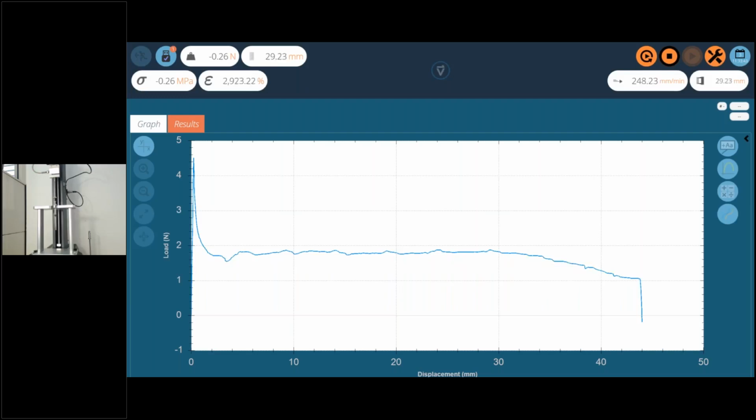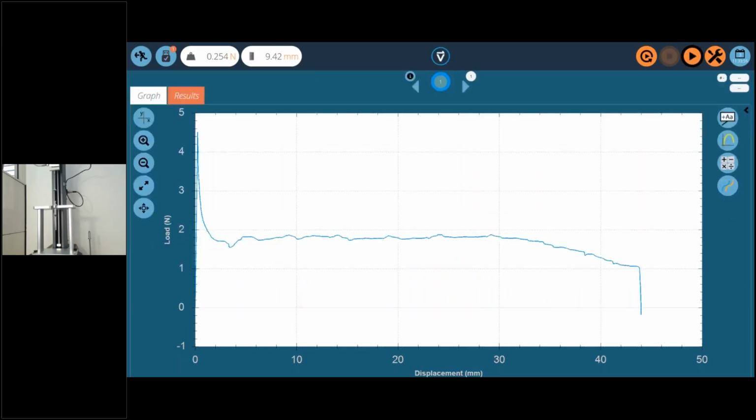Okay, the test has completed. The compression probe returns to the home position, and that allows the operator to remove the tested sample. We'll put another one in. It's a new one. Oh, that's all right. We'll drop the needle, but that's okay. So that's all there is. In seconds, we are already there.